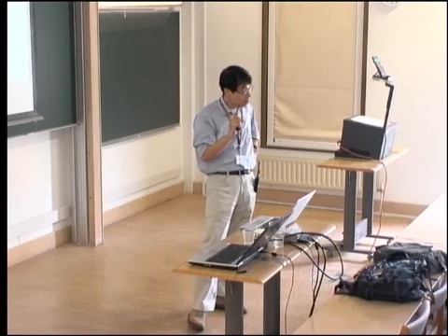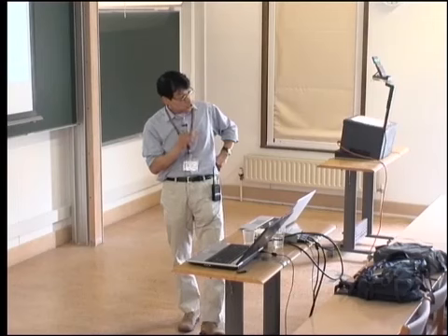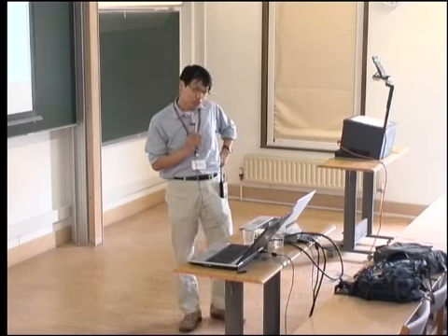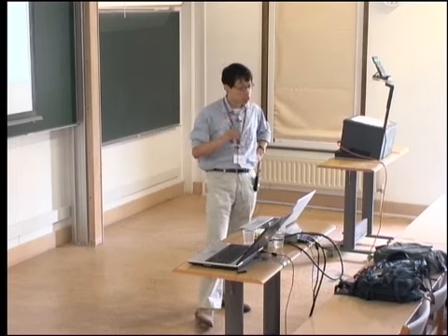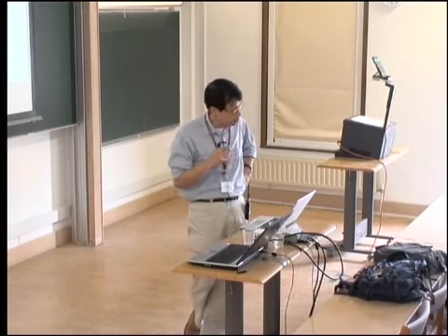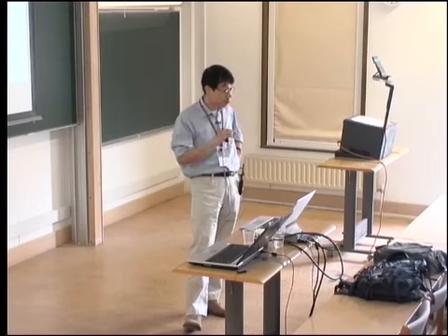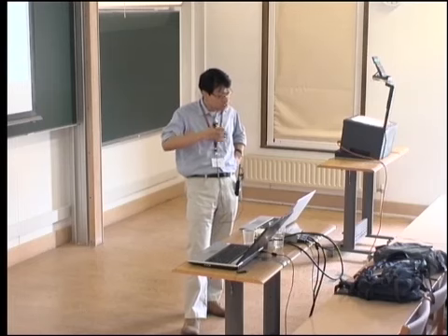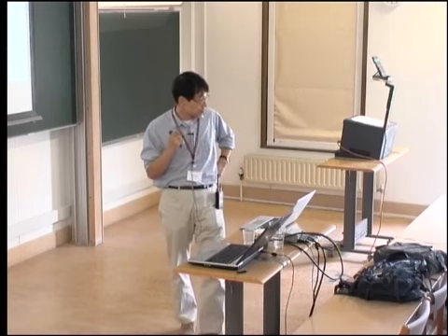So it's actually a difficult issue, and what we find is that if you're interested in finding these peaks, okay, under a statistical significance threshold, as you sequence more and more, you get more and more binding sites. Okay? You can only talk about saturation if you have some threshold for enrichment ratio. Okay? So this is actually, I think, quite similar to people that do disease association studies. If you have more and more patients, you're going to find more and more genes that are correlated with that phenotype. Okay? Except that those genes that you find later on are those with small effect sizes, right? Small odds ratios, and that's what we find with ChIP-seq data.